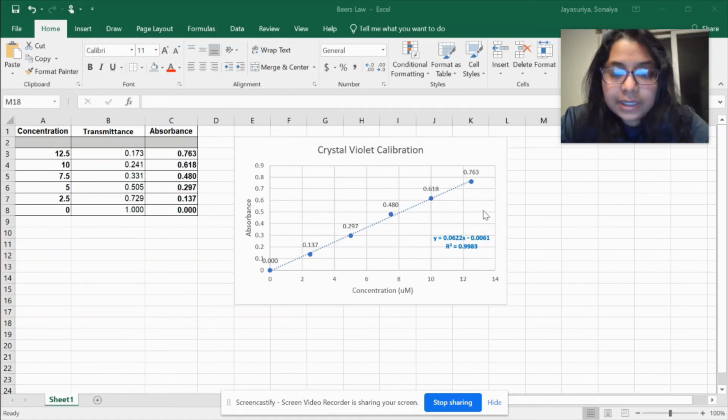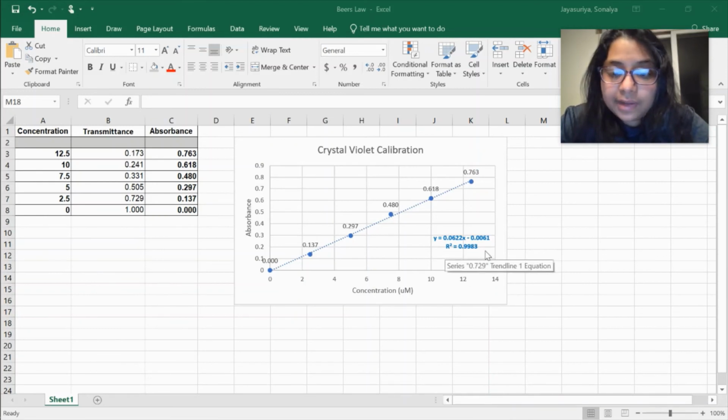So you got your trend line, and then you got your equation. You can actually have Google Sheets give you the equation for the line as well. So look at this equation. You got an equation for a straight line, and this value displayed right here on the bottom is actually the R squared value. The R squared value, the closer you are to 1, tells you how close your data points lie to the best fit line, okay?